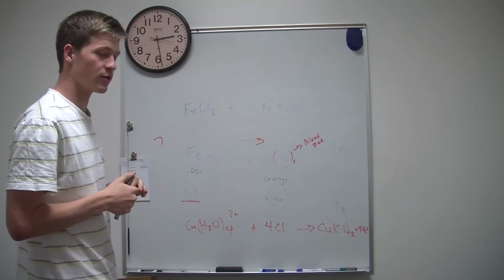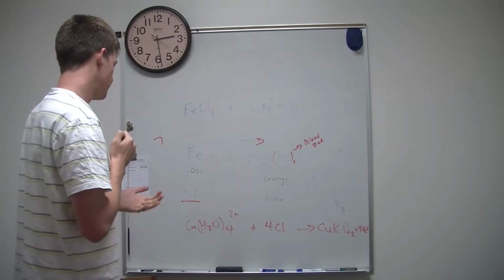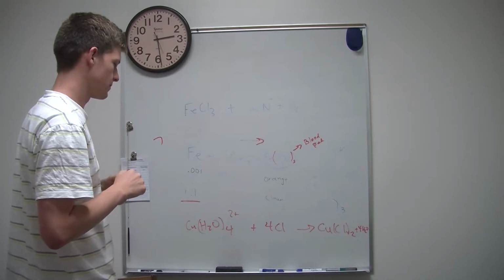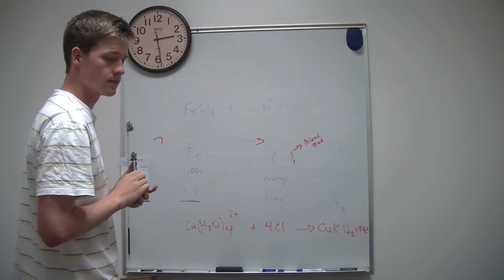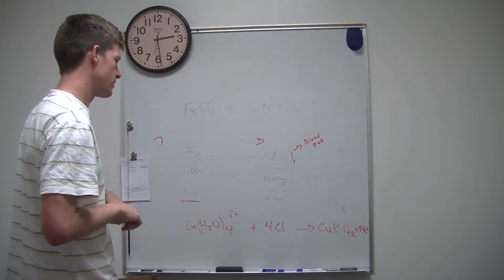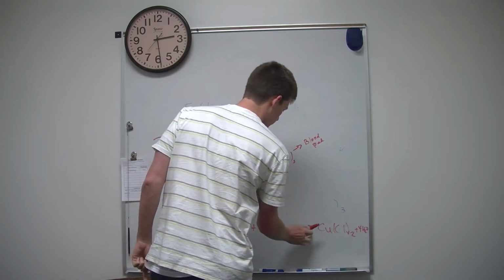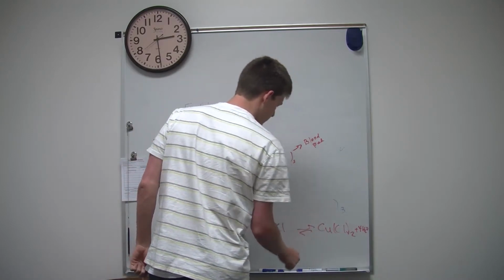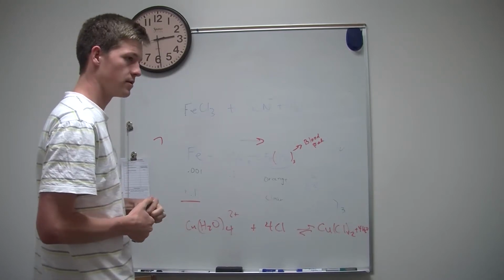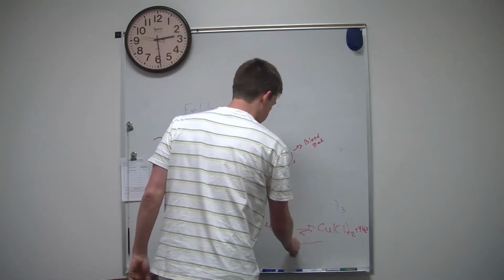And now we're saying we added more water. It says you add 5 milliliters of distilled water to the mixture. So what happens is you're adding copper nitrate to hydrochloric acid, and it comes out with the equation. Which way would it shift? It would shift to the... So if you add water, it's going to shift left. This way, right? Yeah.